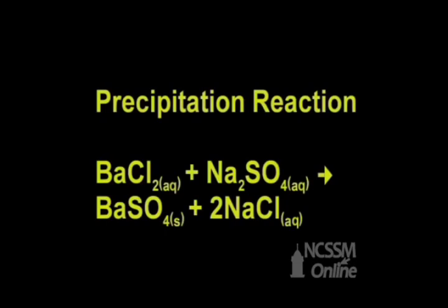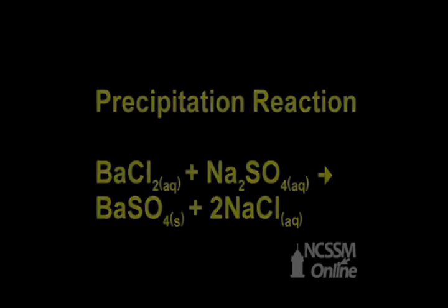This is a double displacement reaction and also a precipitation reaction, because both react to form barium sulfate precipitate, showing white color.